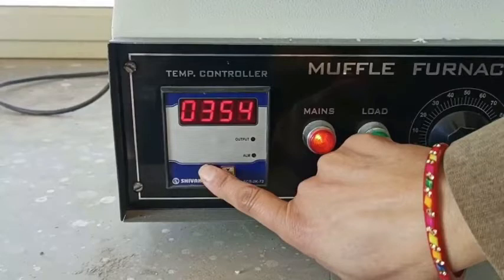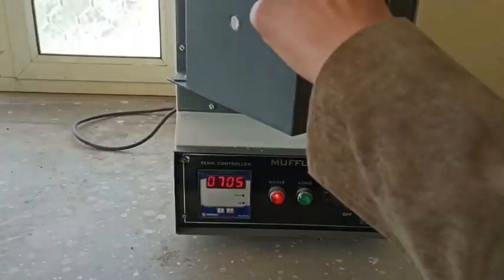Then switch off the mains button and let this muffle furnace temperature cool down to room temperature — only then you open the chamber. That is the correct exercise. Actually, once the temperature reaches 705, I just open this muffle furnace chamber.